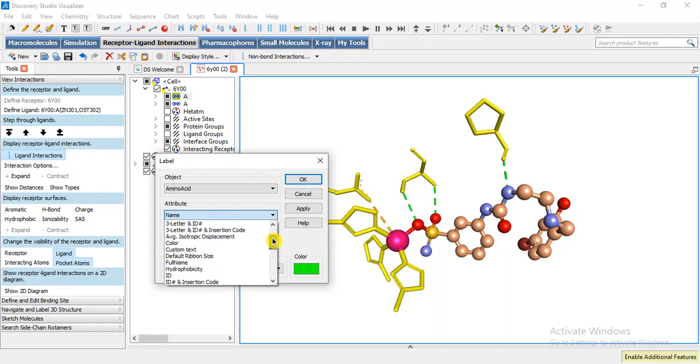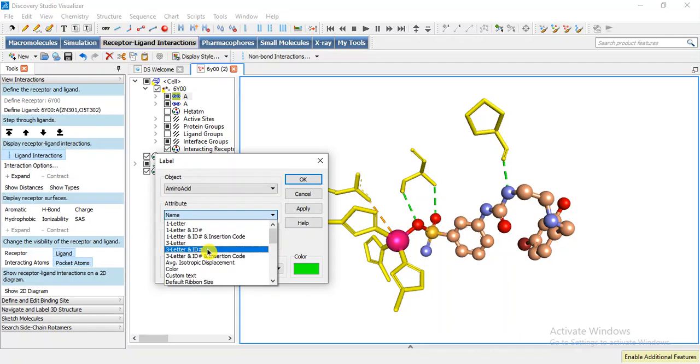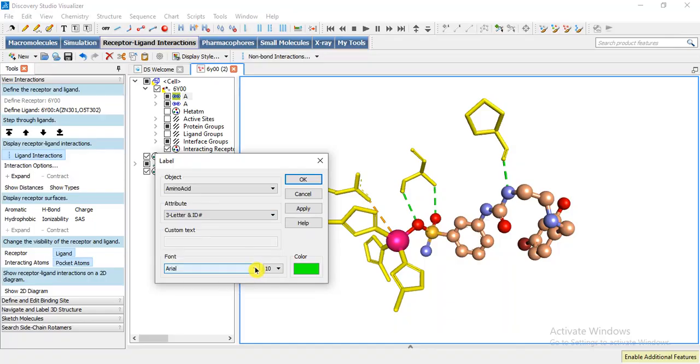Letter and ID we can use three letter and ID and insertion code and the format.